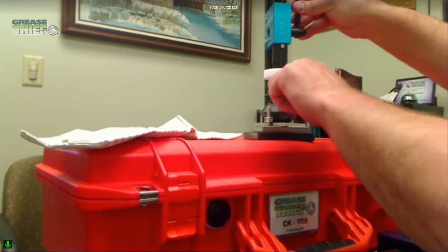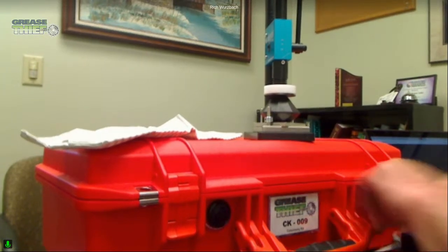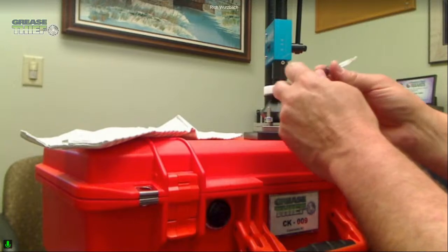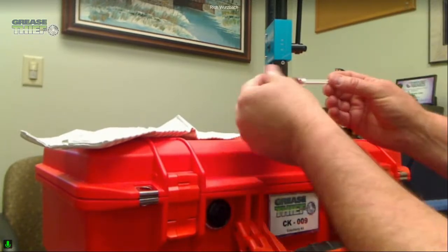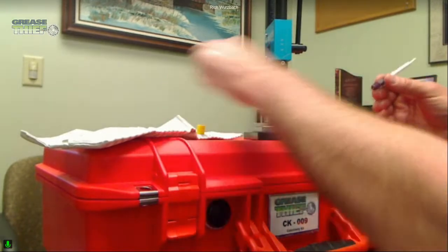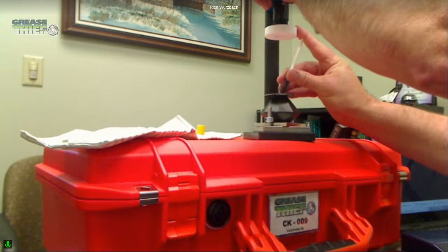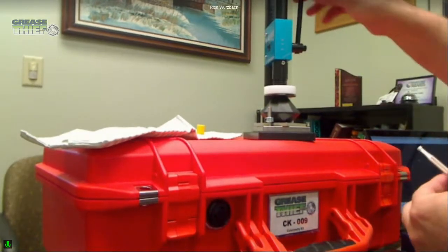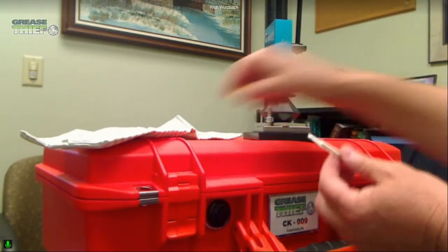But here's the space where the grease is going to go, and that could be as simple as taking the Grease Thief that you have and removing that yellow cap and just dabbing a little bit right there and being able to adjust that down and take my measurement. So that's my colorimetry. Again, about a 30-second process.